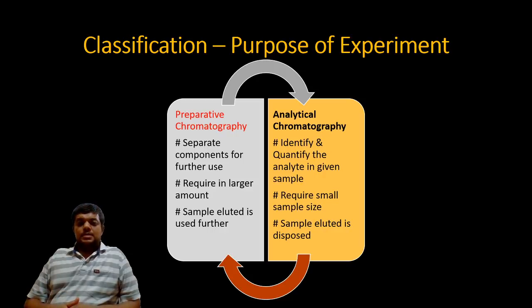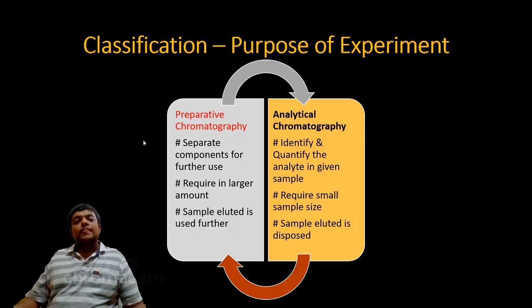First condition, classification based on purpose of experiments. Always remember, on the purpose of experiment basis, chromatography can be classified into two: preparative chromatography and analytical chromatography.